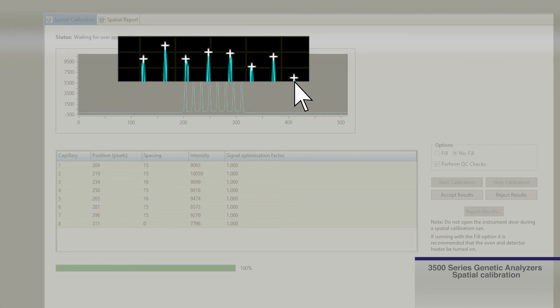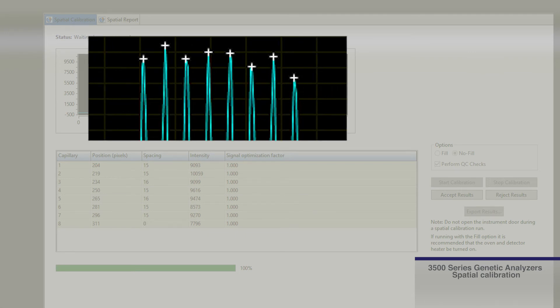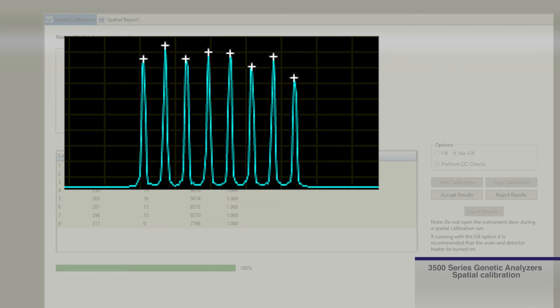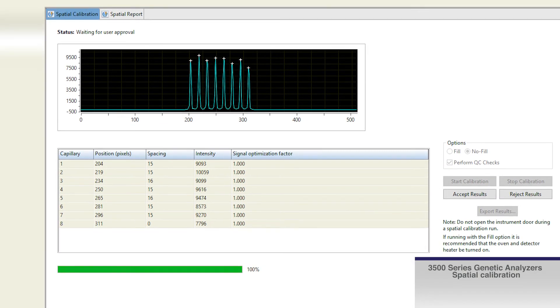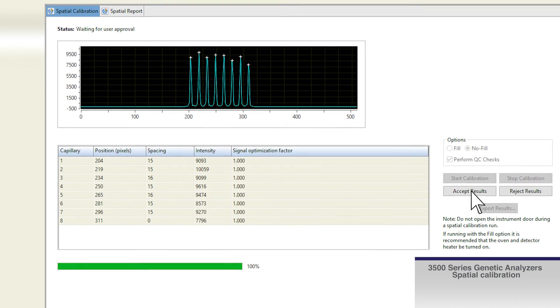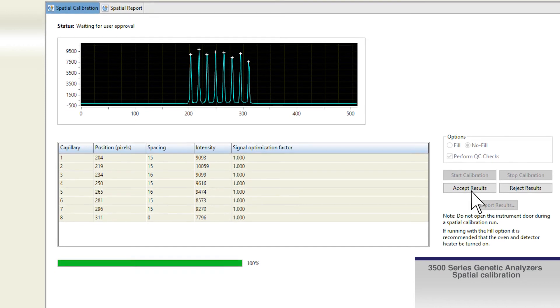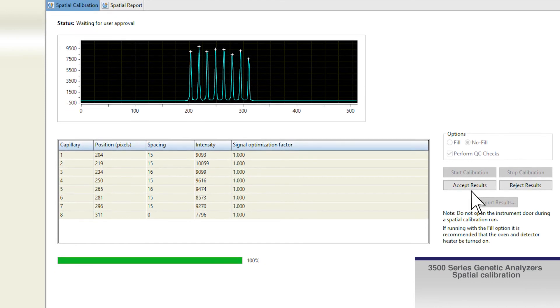Look for one marker at the apex of each peak, no off-apex markers, and an even peak profile with peak heights about the same. With a passing spatial calibration, click accept results to apply the new calibration.